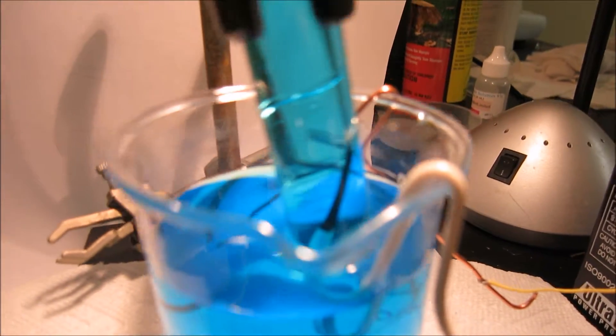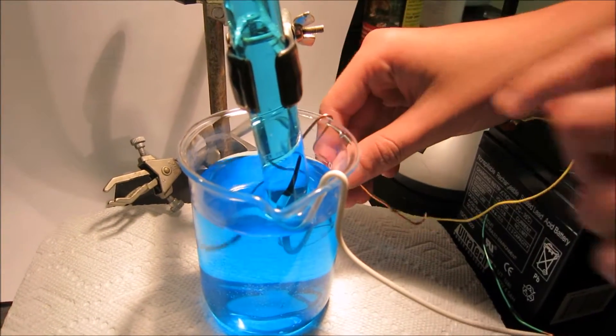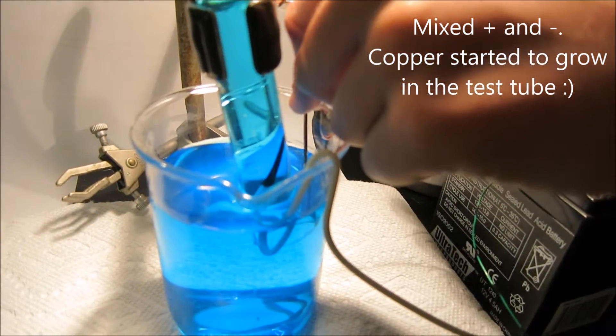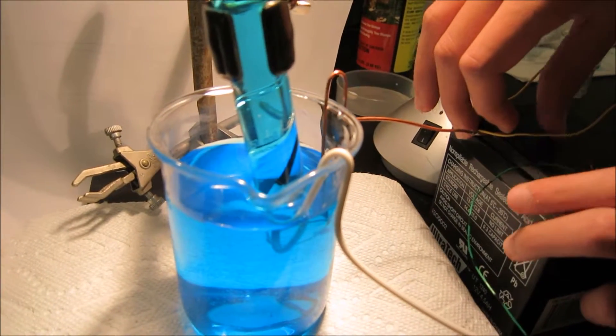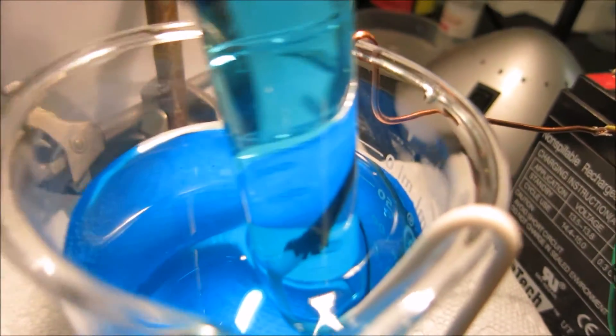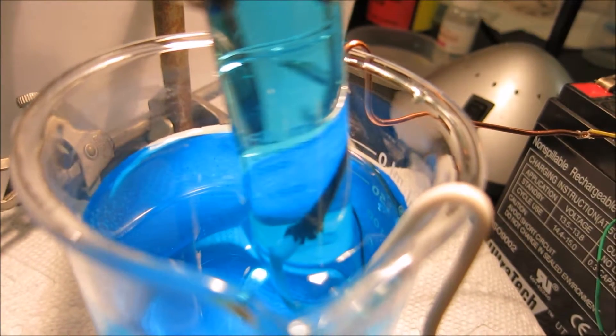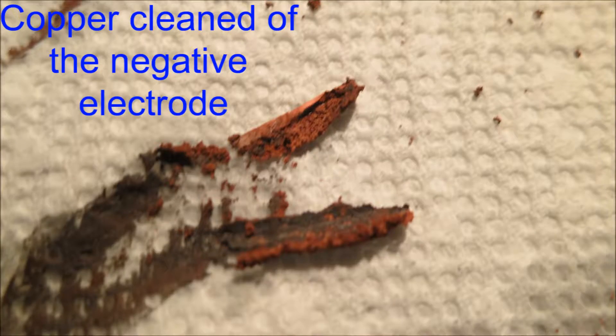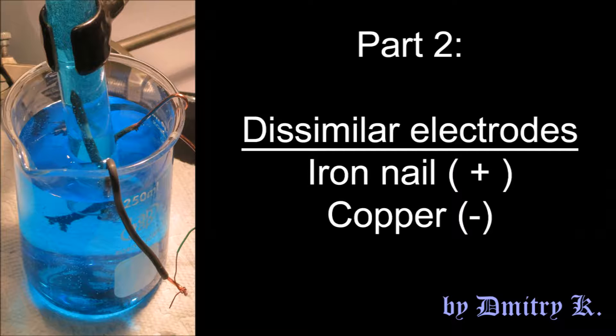Now the electrolysis should begin. Let's close the circuit — on one electrode the copper is dissolving and on the other electrode the copper is precipitating, forming an interesting looking shape.